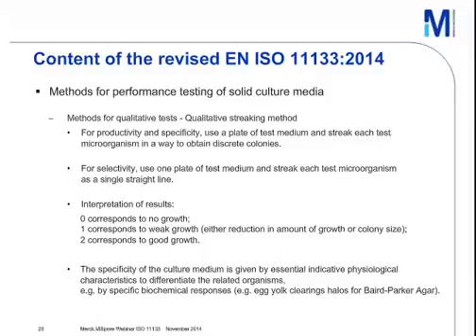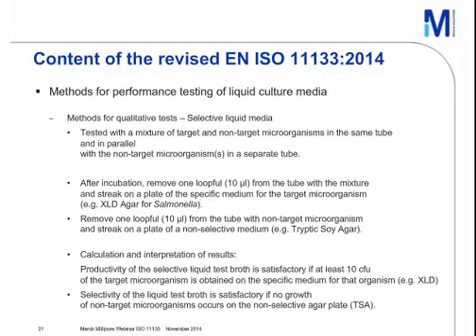The specificity of the culture medium is given by essential indicative physiological characteristics to differentiate related organisms, for example, by specific biochemical responses, such as the egg yolk clearing halos for Baird-Parker agar. Methods for the performance testing of liquid culture media are given as well.